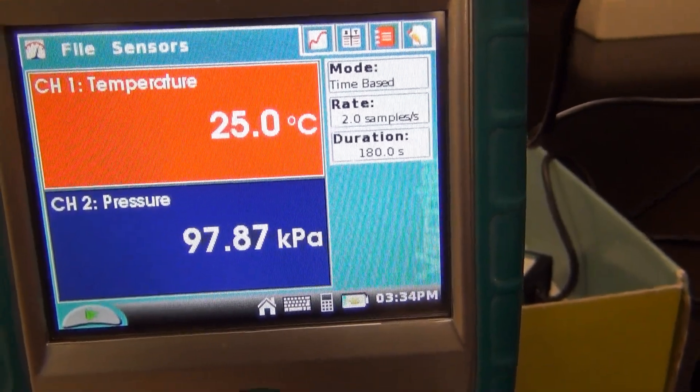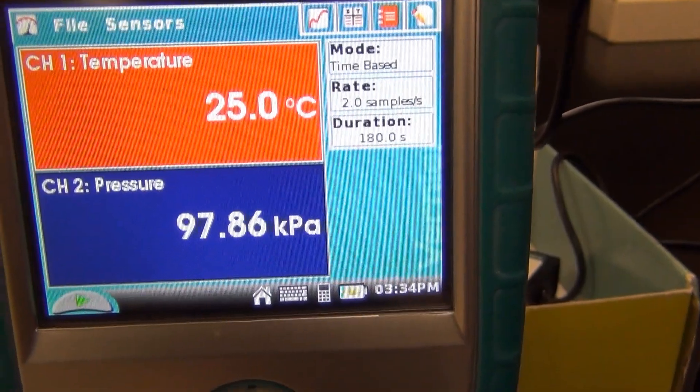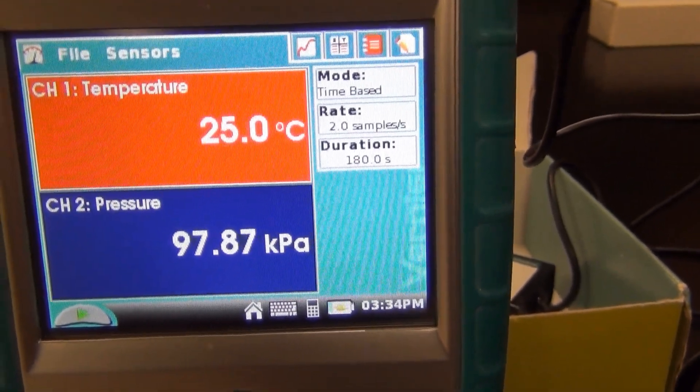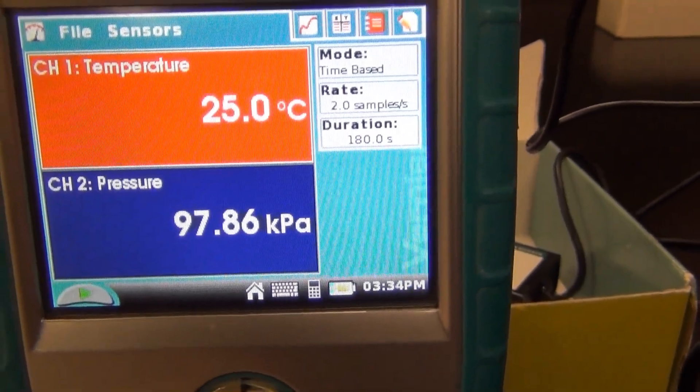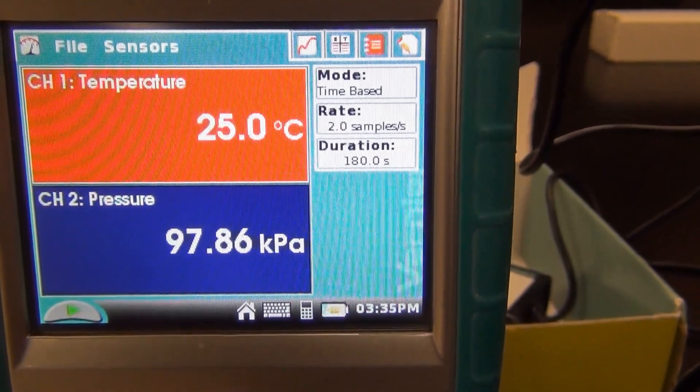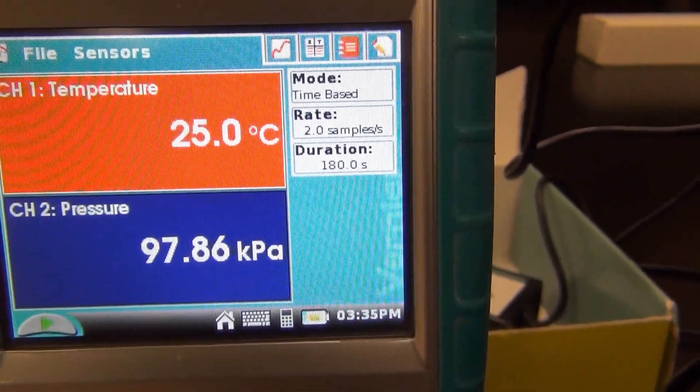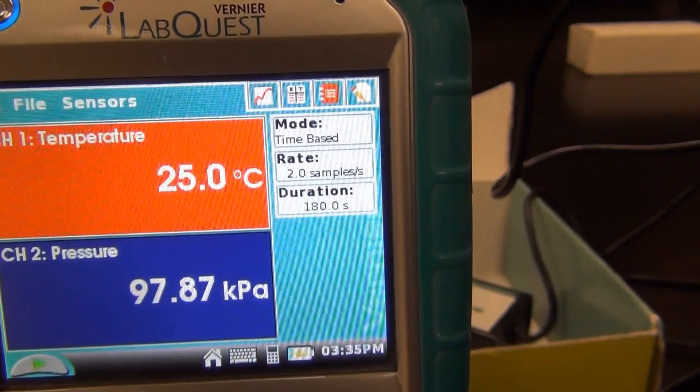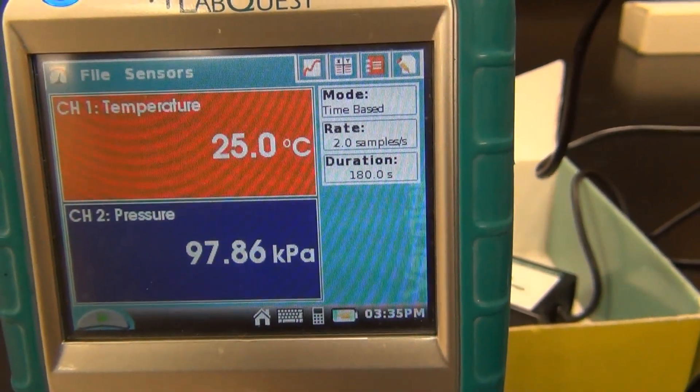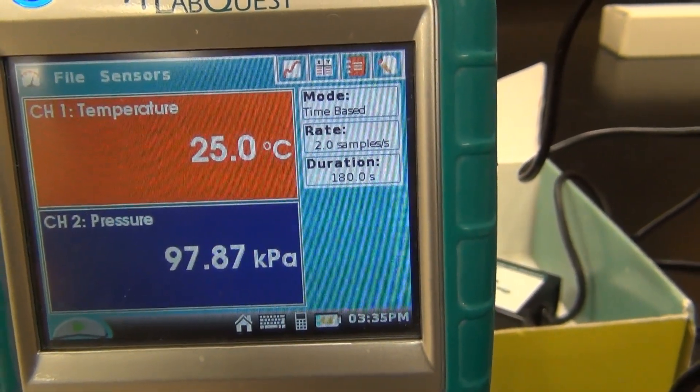This is a gas law experiment. We know we are going to have to be sure we know what the temperature and pressure are in the room. So I hooked up a LabQuest to a temperature probe and a pressure probe. So we have our room temperature and room pressure. So our temperature here is 25 degrees Celsius, or 298 degrees Kelvin, of course. And our room pressure is 97.87 kPa.